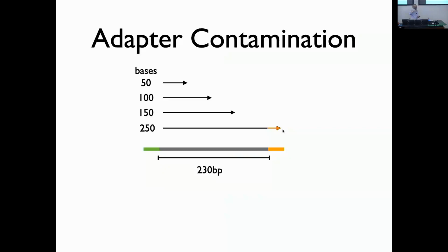So we're not worried about whether downstream steps are handling the adapter correctly or not. Like I said, sometimes adapter contamination, having adapter sequence stuck in with the biological sequence, can create problems, and sometimes it really doesn't matter at all.